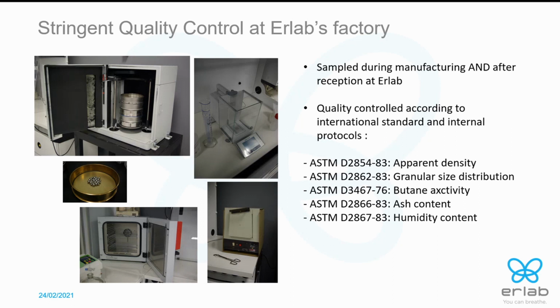There are, of course, the international standards, but also some internal criteria we developed that are more stringent than the standard. I listed here some norms, for instance the ash content, so you cannot have more than a specific percentage of ash. Or humidity content, so the carbon cannot be more humid than a specific limit, or the density, etc.